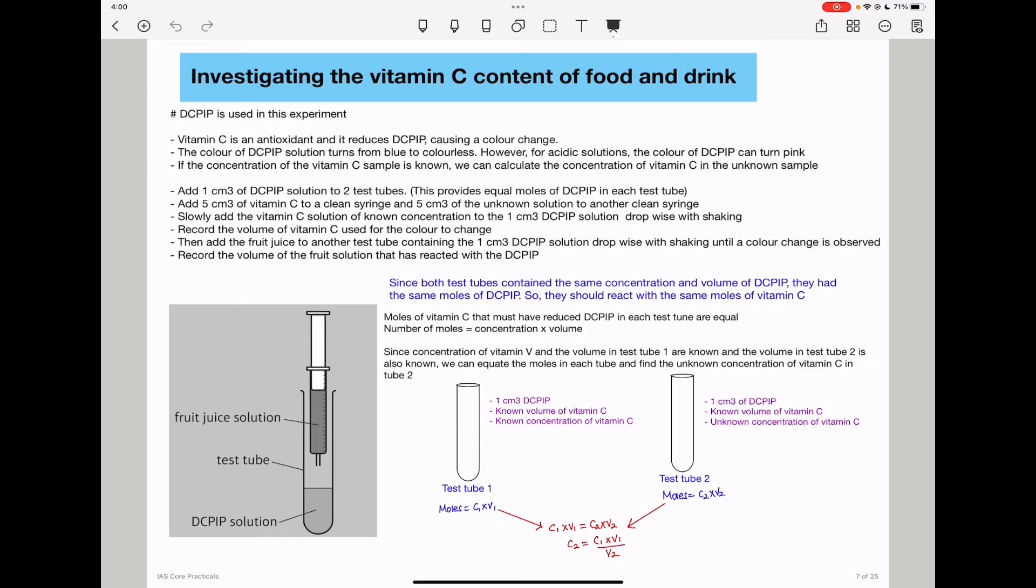So you'll do the same thing for the other experiment. And again, to another test tube with 1 cm³ of DCPIP, use a syringe containing 5 cm³, and add the unknown vitamin C sample drop-by-drop as you shake until the sample is decolorized or until it turns pink if it's acidic. And also record the volume of the unknown sample that has been used from the syringe. And then carry out a calculation as below.